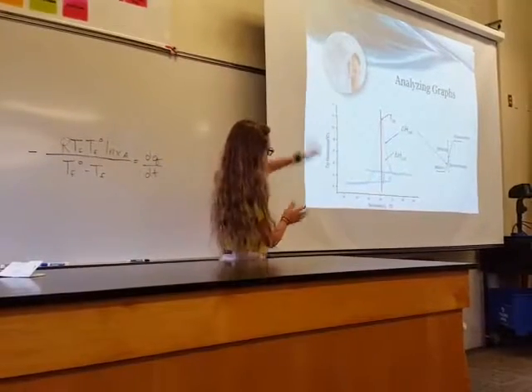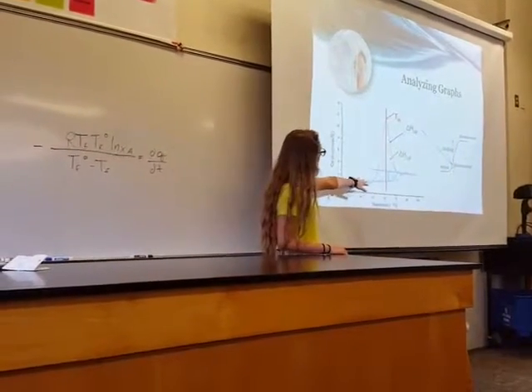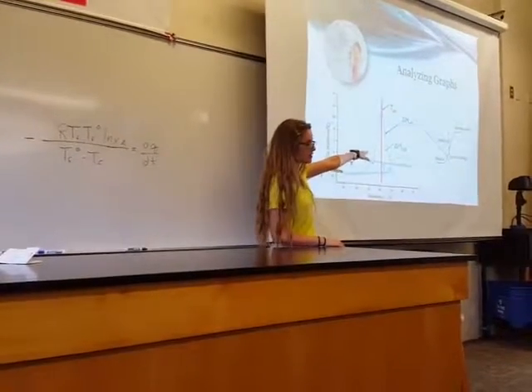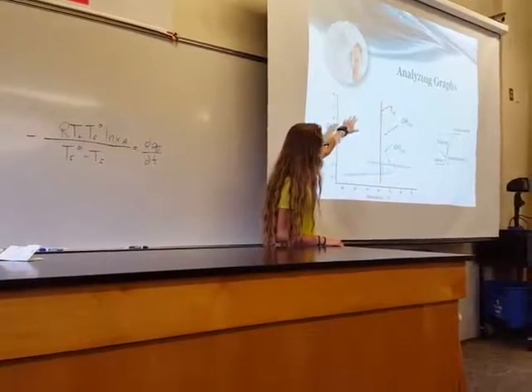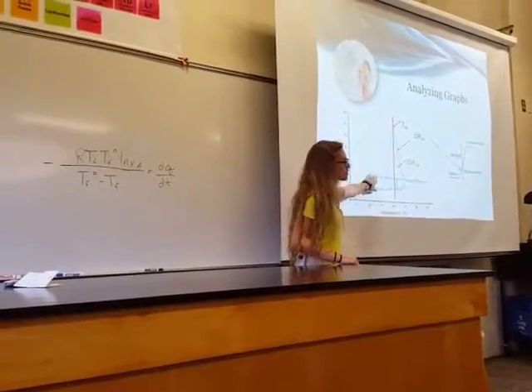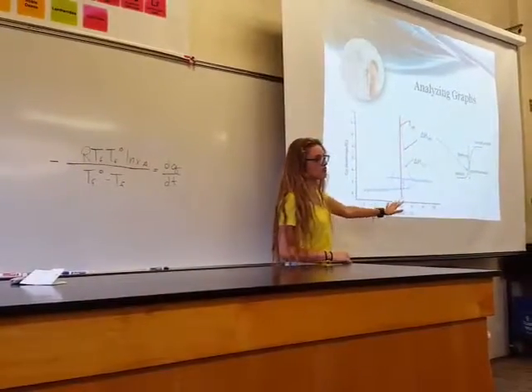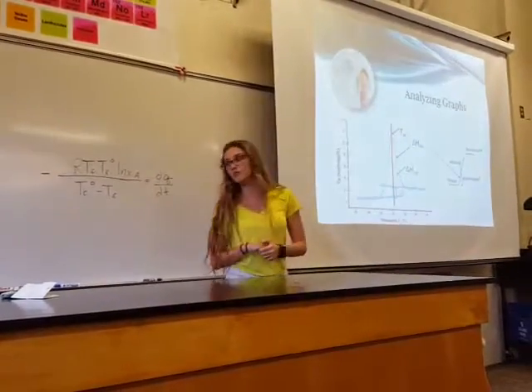So just some data that you're able to get. This is just a little bit of it. You're able to get the change in heat capacity, the delta H, or the change in enthalpy, the melting temperature, the onset temperature, or the freezing point or melting point, and that's just a couple of the data that we're able to get out of it.